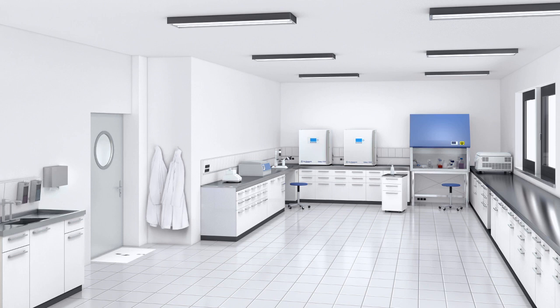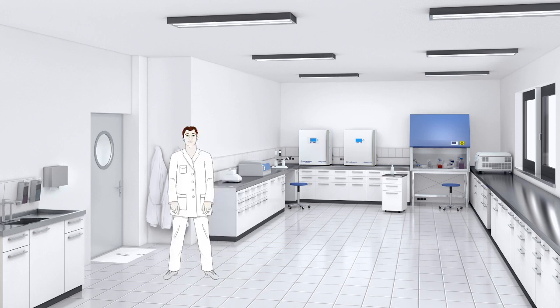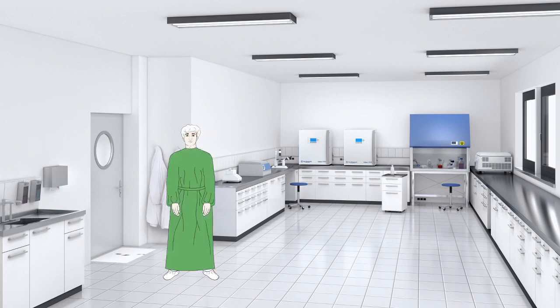Just left of the biosafety cabinet, there are two incubators which are important for keeping the cells, and they would provide the proper environment for the cells to grow. Other than that, there would be centrifuges, microscopes, cell counter, etc. There are certain norms that you have to follow when you're working in a cell culture lab, such as wearing a covered lab coat all the time, and if you're culturing something which is infectious or any other serious material, then you should have an additional layer of protection. You should have your proper PPE kit in order to culture the cells.